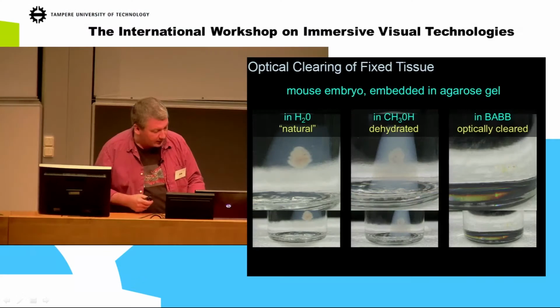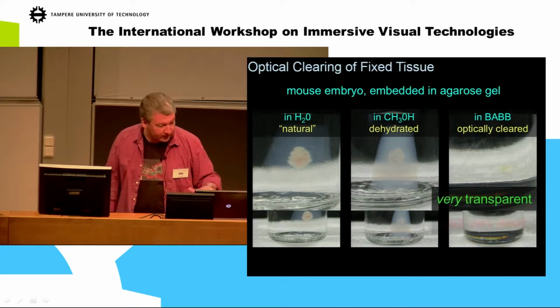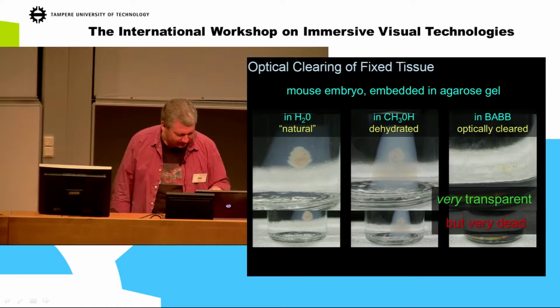So you can take some really nice images because, of course, the samples are very transparent. The downside is, of course, that they're very dead as well. You can't do dynamics in this kind of situation.